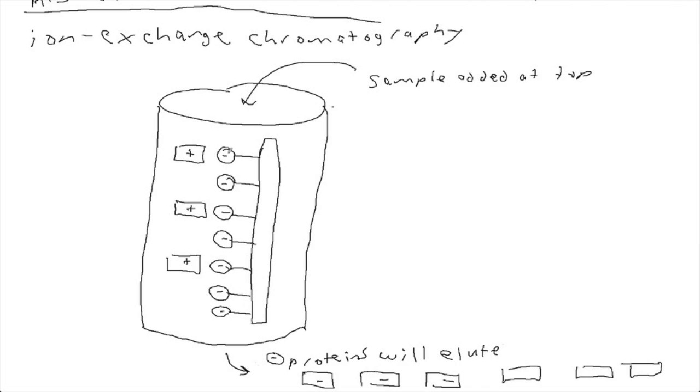Is it possible to use positive beads? Yes, that's possible too. If you used positive beads, who would get stuck? The negatively charged proteins. And who would elute? The positively charged proteins. That's right, if we used positive beads. Okay, very good.